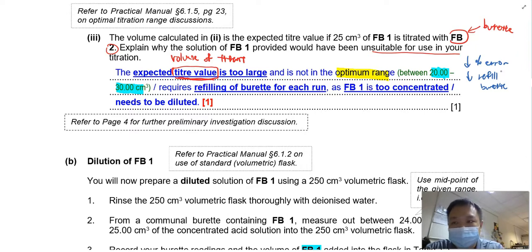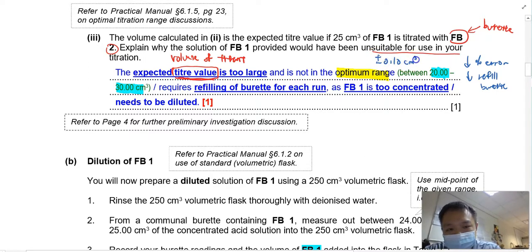So it is a plus minus 0.10 cm3 uncertainty when you do a measurement. Percentage error is defined as the uncertainty divided by the absolute value. So if I use a larger absolute value, the percentage error becomes smaller. If you want more information on percentage error, please read your lab manual, under the section on percentage error, error analysis.